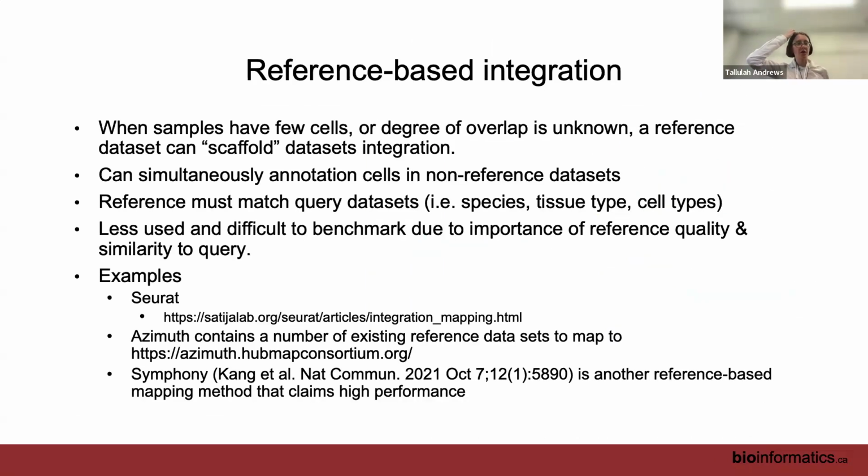The last major approach to integration is reference-based integration, which arguably isn't really a different method. It's not a different algorithm for doing it. It's just instead of taking two data sets and considering them equal to each other and trying to mix them together, you take one big good data set as your reference, and then you try to map your new data set onto that. So here you're mostly keeping that reference data set the same, and you're mostly just changing your new query data set.